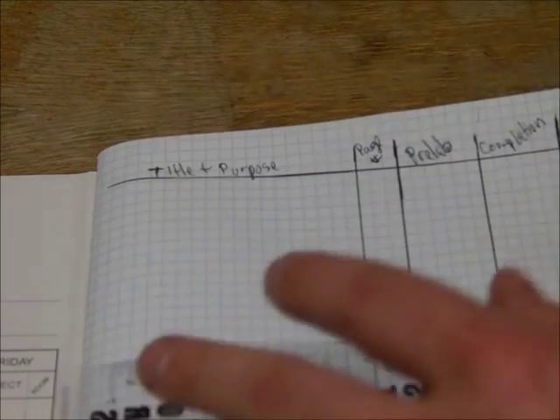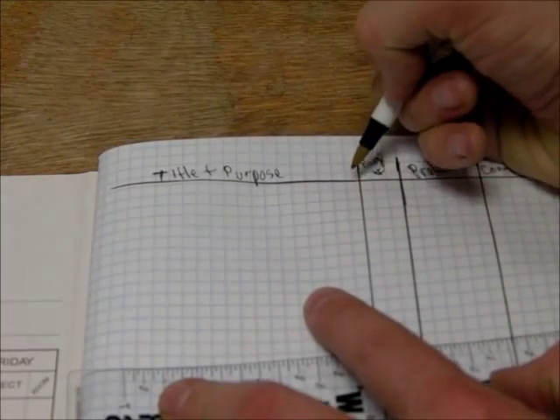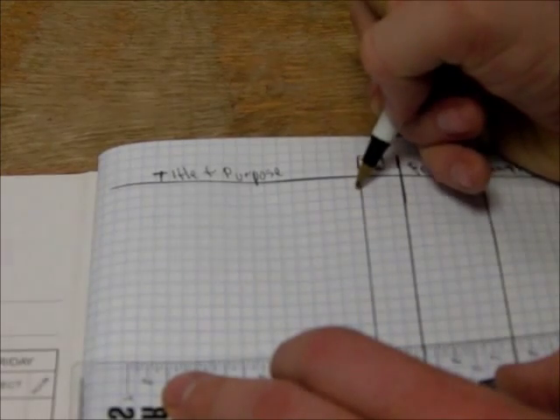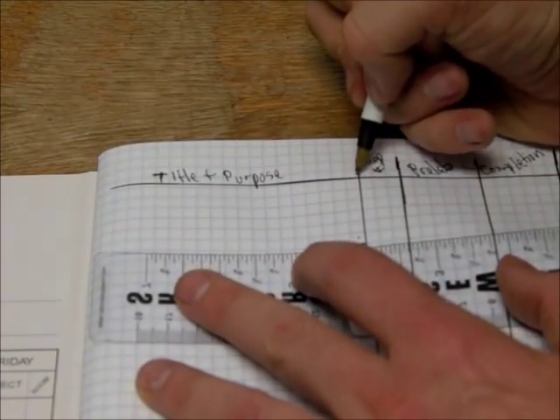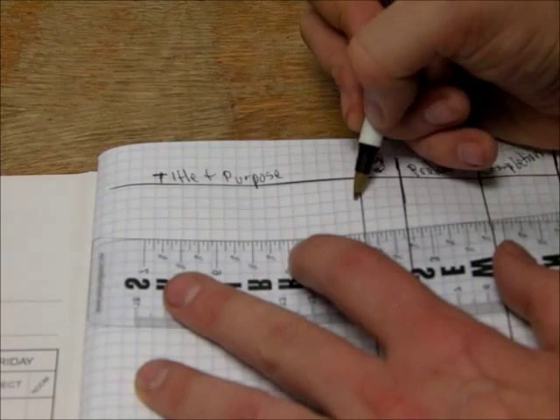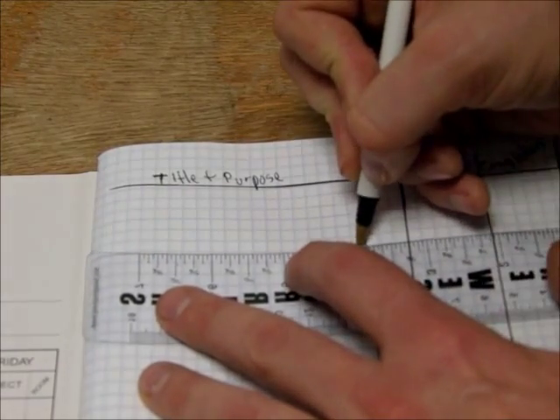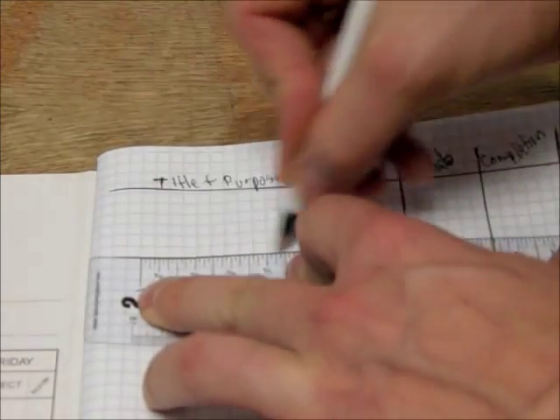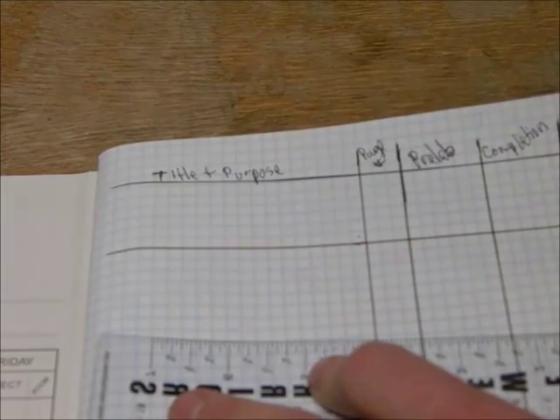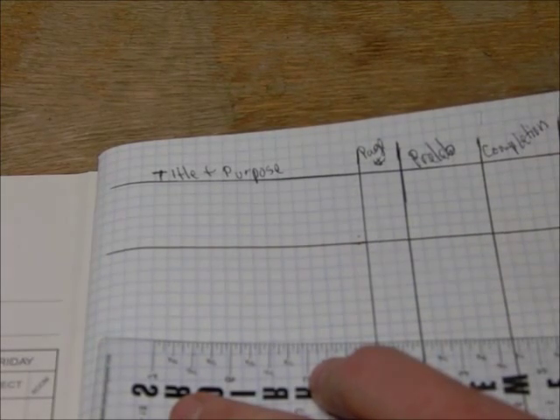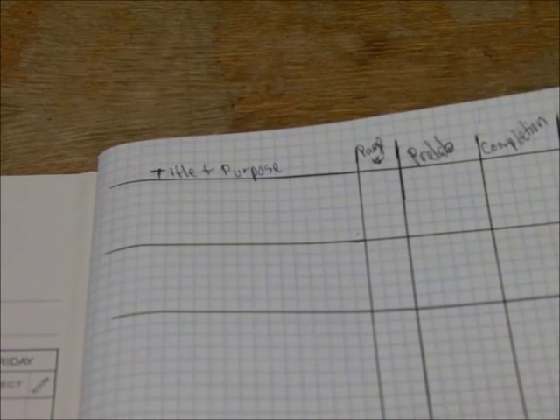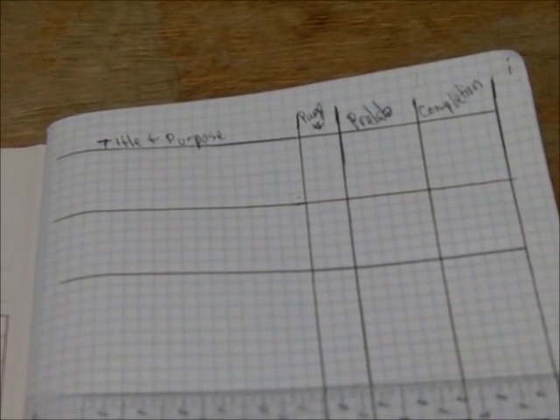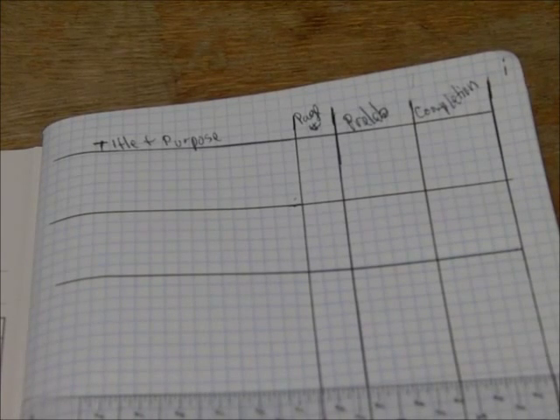Now that we have the top of the table set up, we're going to set up the rest of the page. What you're going to do is count down from the top line by the title and purpose by six squares. Two, three, four, five, six. I'm going to put a tick mark, and then from there, I'm going to draw a horizontal line all the way across my lab notebook. I'm going to do that again. Then you're going to do that for the entire page. Every six squares, draw a horizontal line.